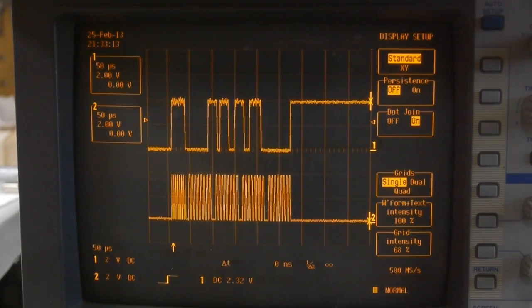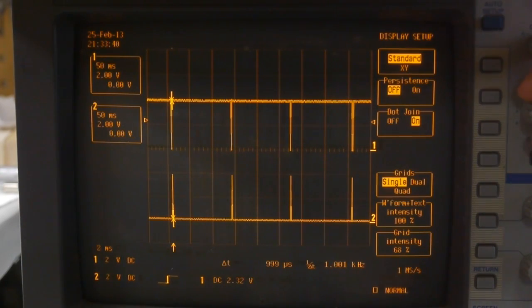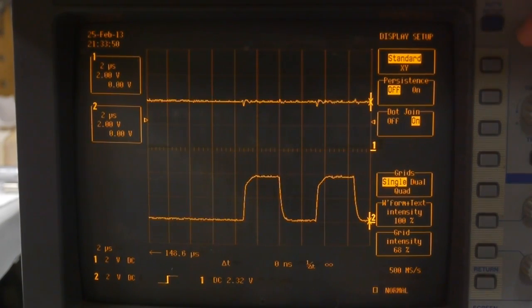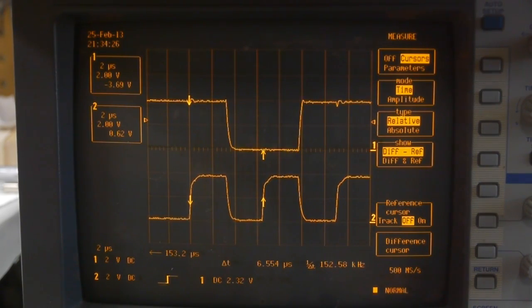The datasheet confirms it's sending data in four-byte chunks, visible as clusters of clock cycles. Currently the scope is at 50 microseconds per division in normal trigger mode. Zooming out to 50 milliseconds per division, you can see that burst of data happens periodically at about 7.5 Hz - seven and a half times per second the microcontroller queries the ADC. One difficulty is that the burst is quite fast. Zooming in, the clock period is about six and a half microseconds rise-to-rise, which works out to around 150 kilohertz.